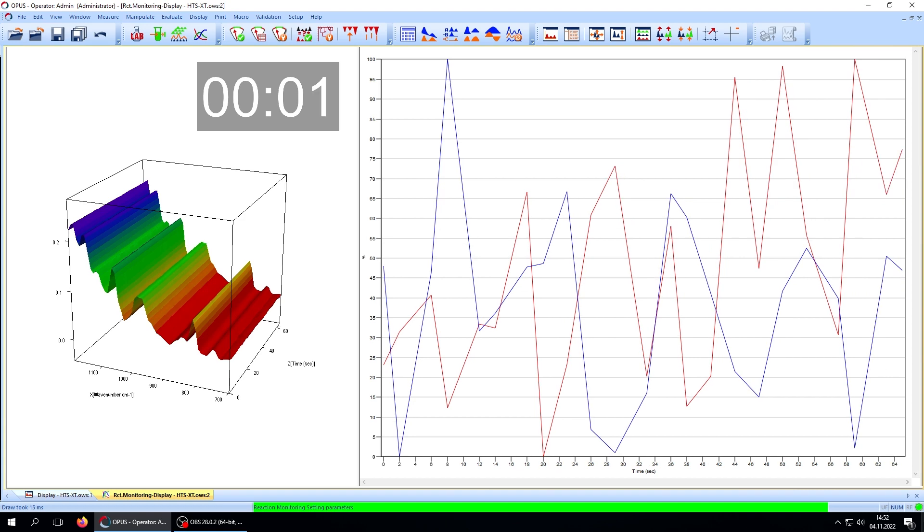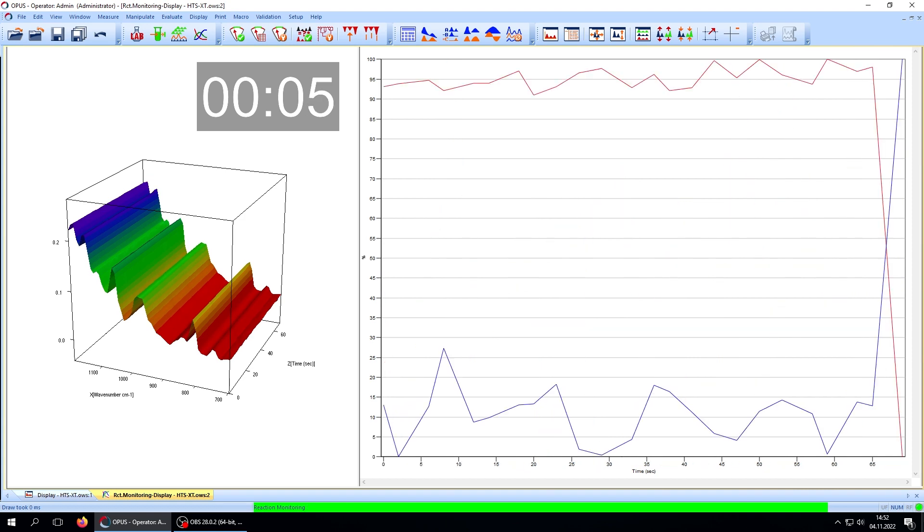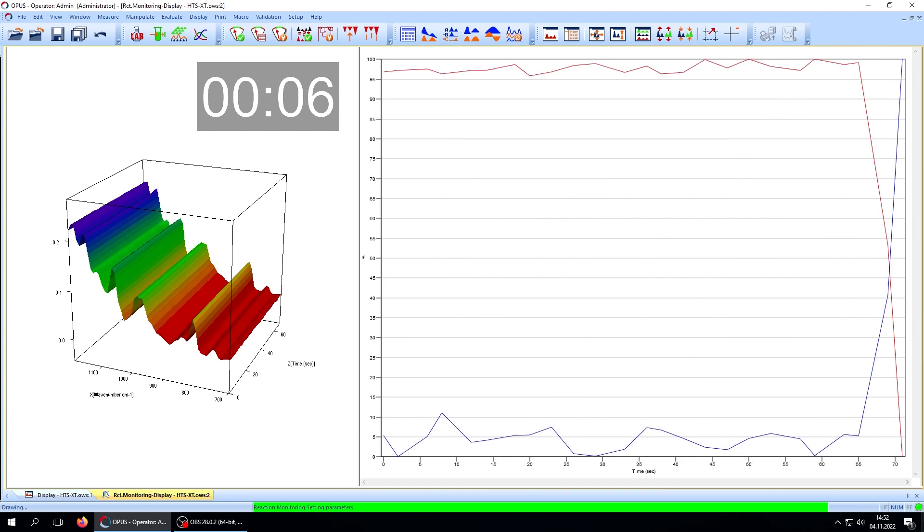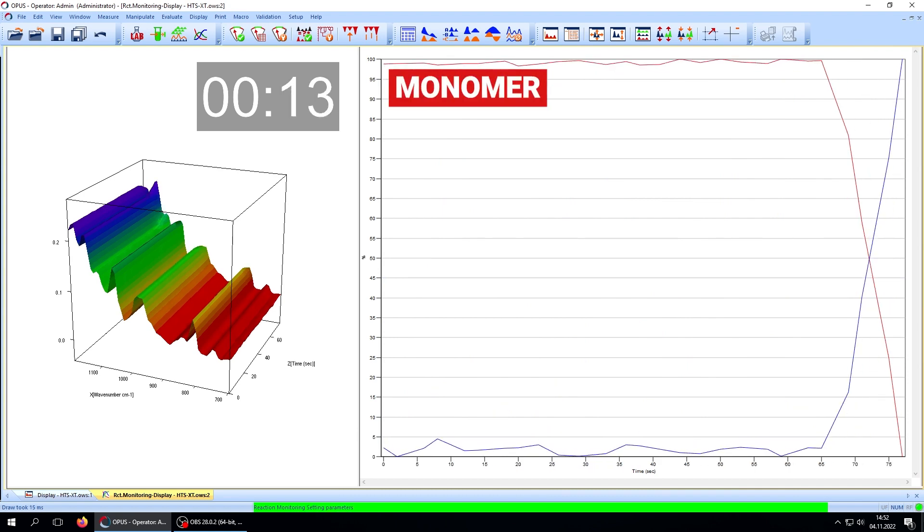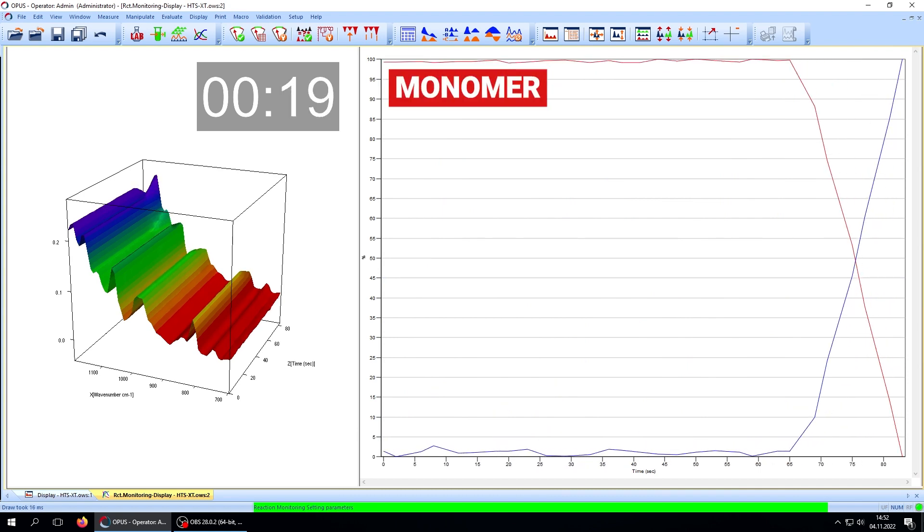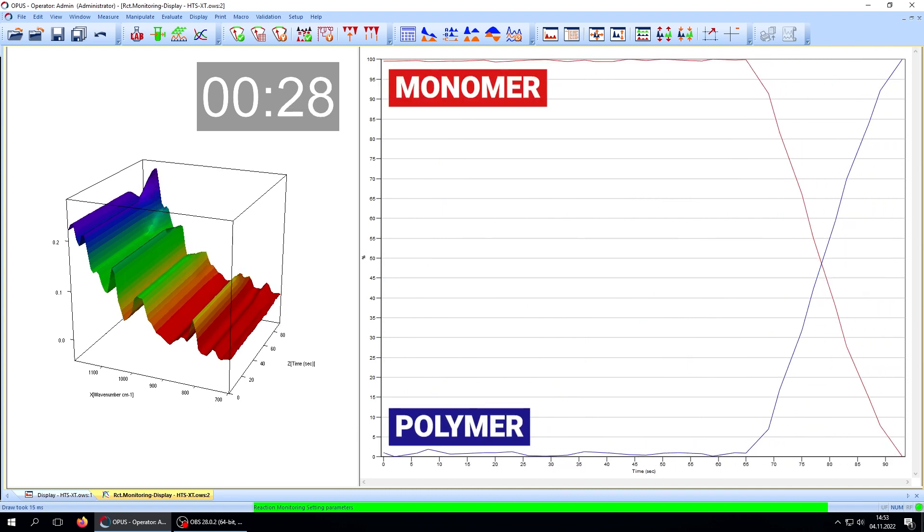Back in the software, we can see the reaction kick off immediately. The red line is representative of the acrylate monomer, while the blue line indicates the increase of polymerized product.